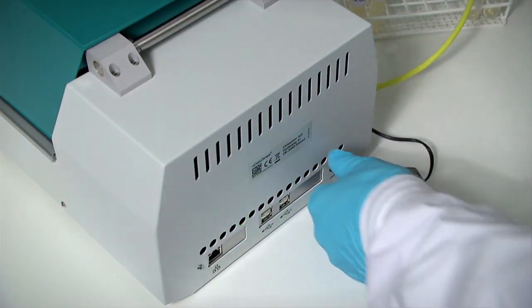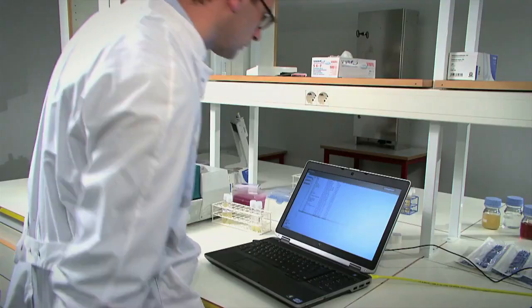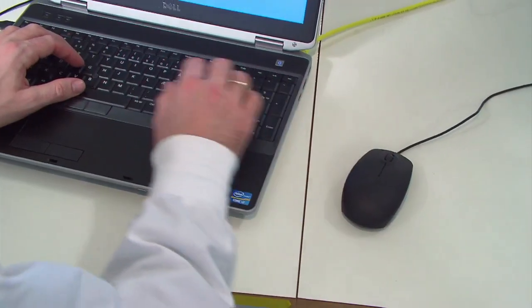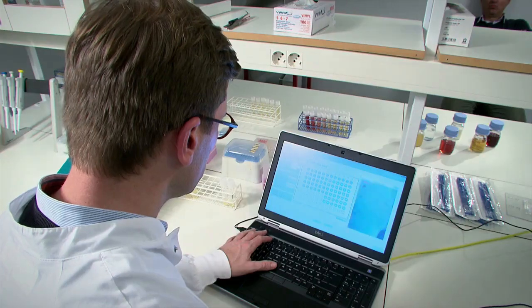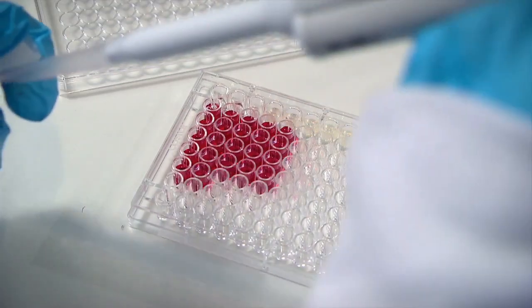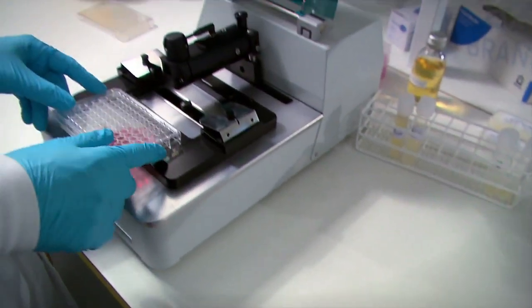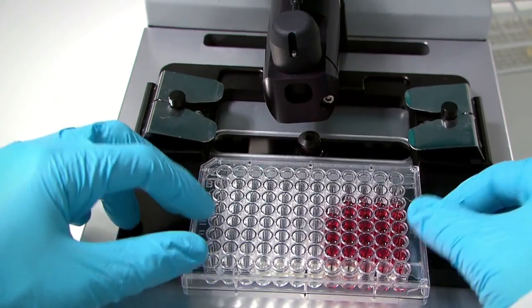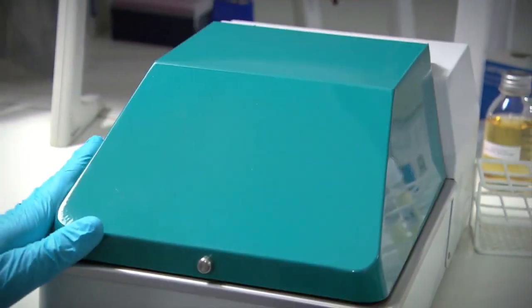This video shows how to use oCelloScope to measure bacterial growth in a monoculture. oCelloScope is run and monitored using a standard PC and only requires a normal network cable to connect oCelloScope to the PC. The sample that has to be analyzed is pipetted into the microtiter plate. The microtiter plate is then inserted into oCelloScope with well A1 at the upper left position. The plate is carefully pushed into place and is then fastened.